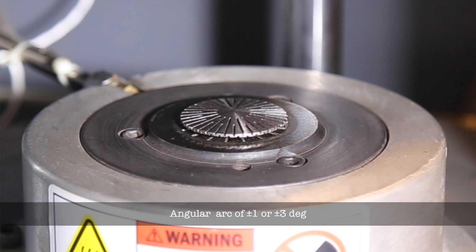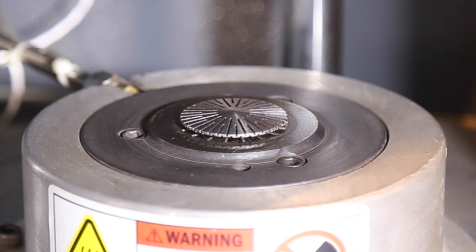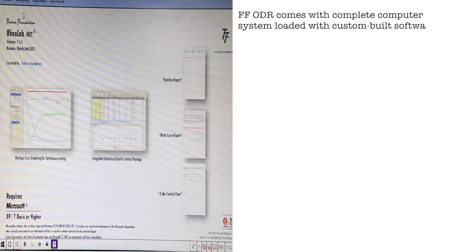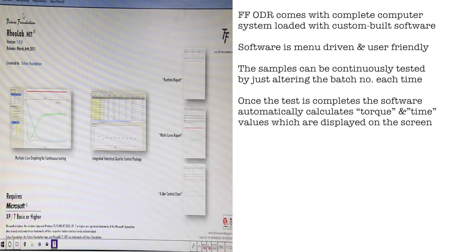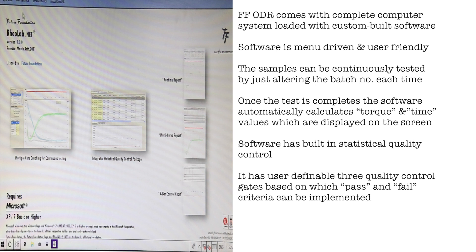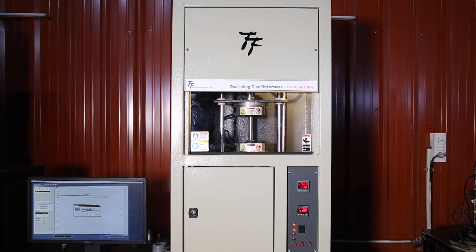Future Foundation oscillating rheometer comes with a complete computer system loaded with custom-built software. The software is menu-driven and user-friendly. Samples can be continuously tested by simply altering the batch number each time. Once the test is complete, the software automatically calculates torque and time values displayed on the screen. The software has built-in statistical quality control with user-definable quality control limits, based on which pass and fail criteria can be implemented. All reports can be printed on any Windows-based printer.